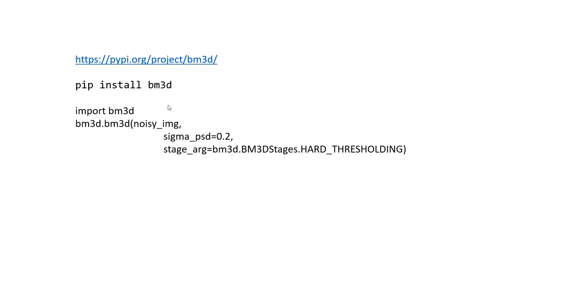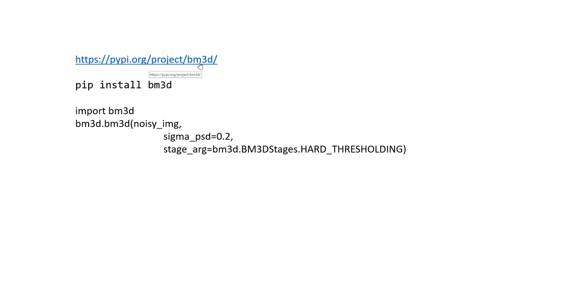First of all, assuming you don't have this already installed, just go ahead and pip install BM3D. That should automatically install the latest version. If not, just go to this page, pypi.org, and look at the project BM3D. You can get the documentation over there. Once it's installed, you just need to import BM3D.